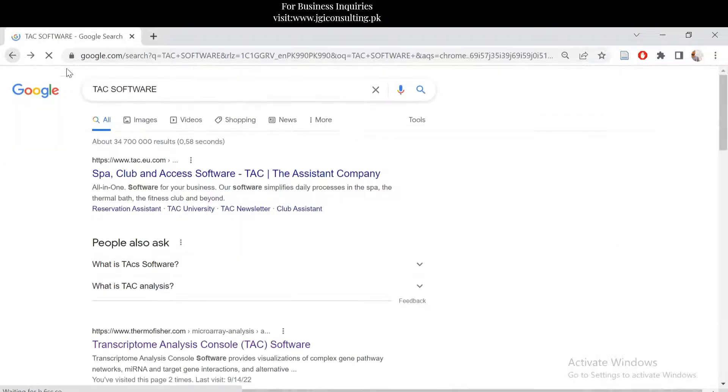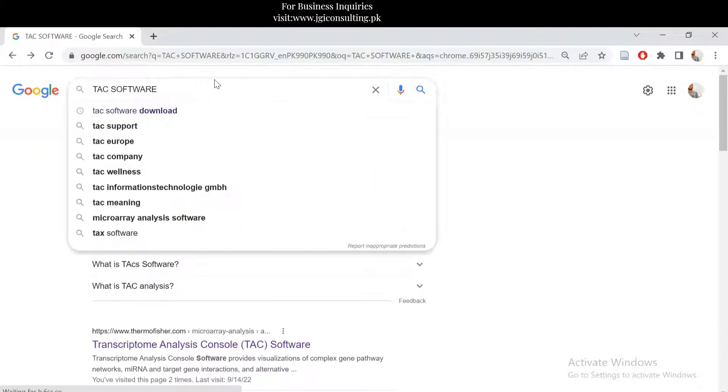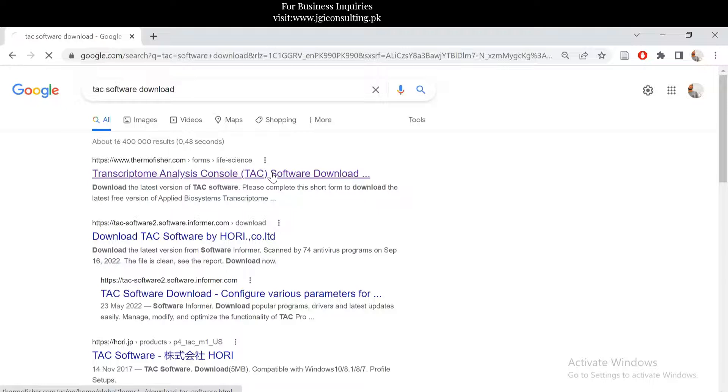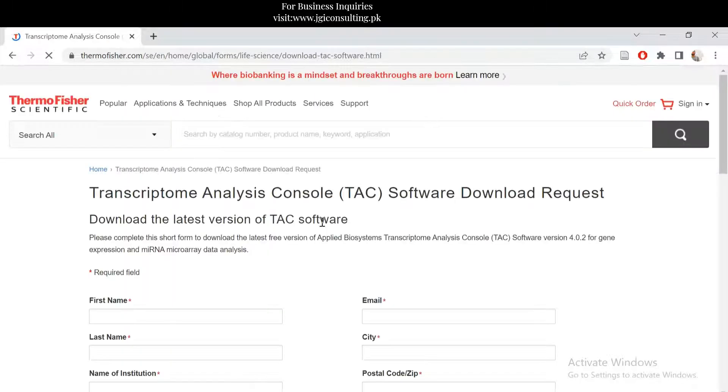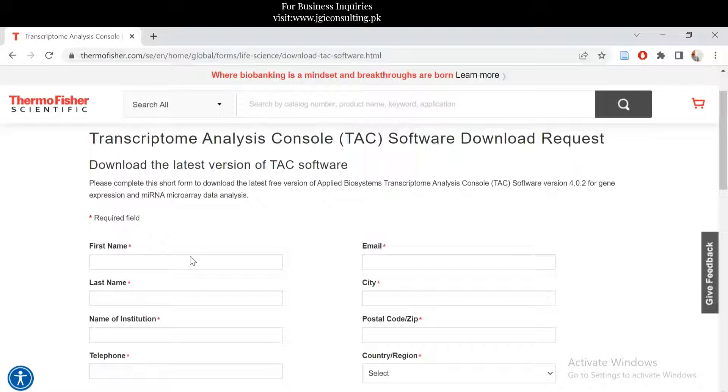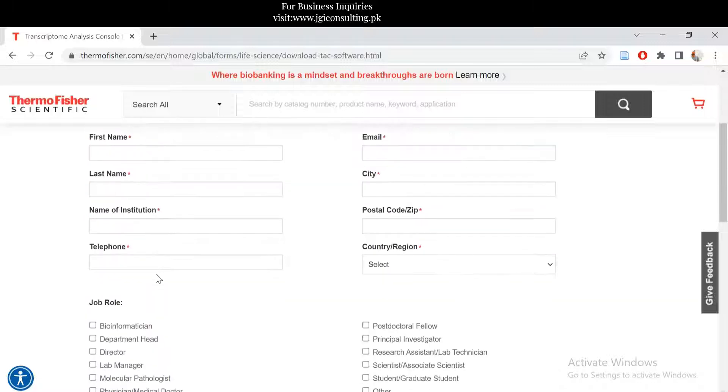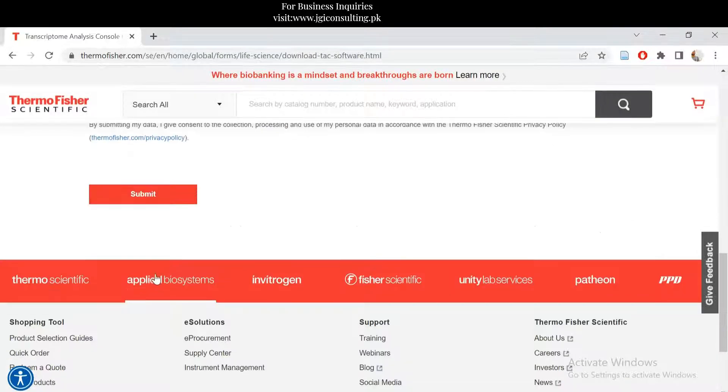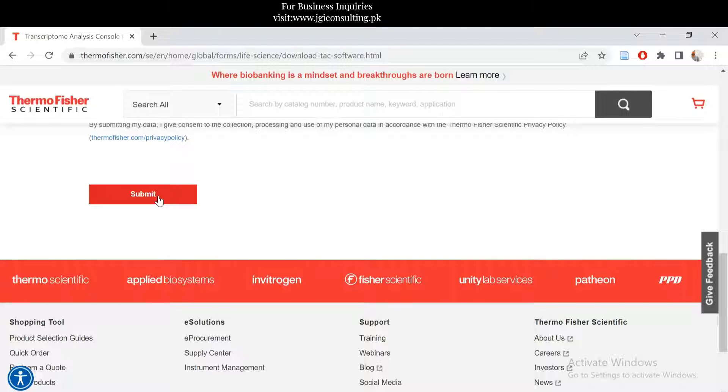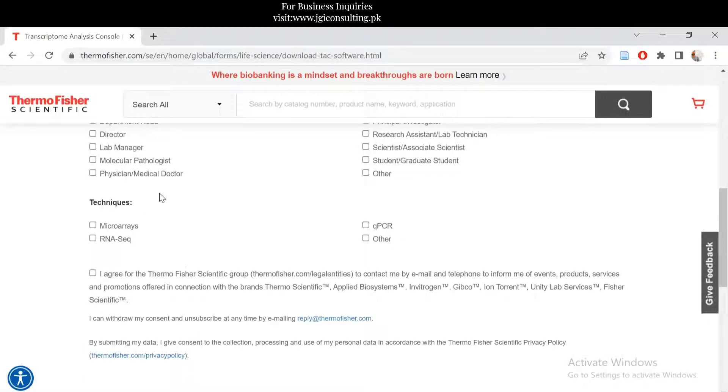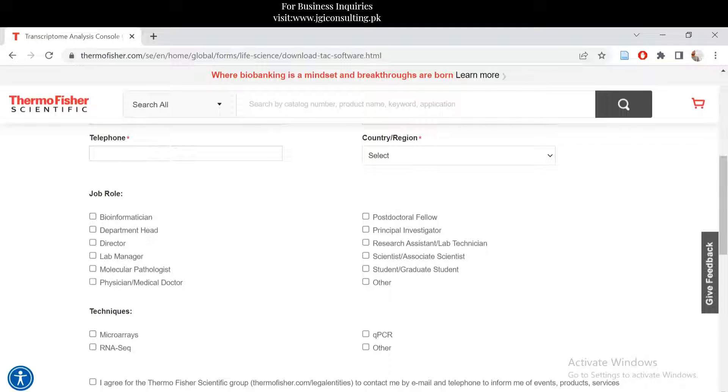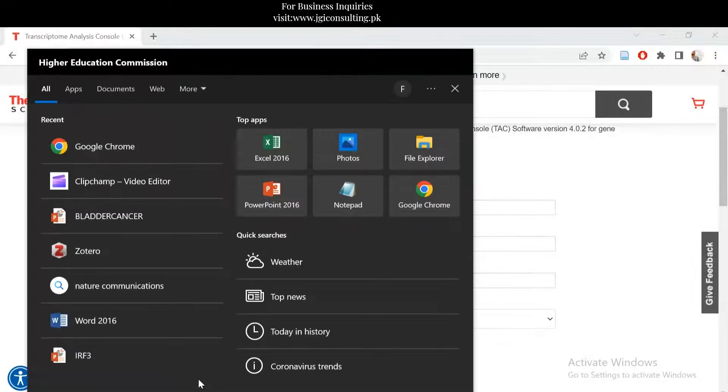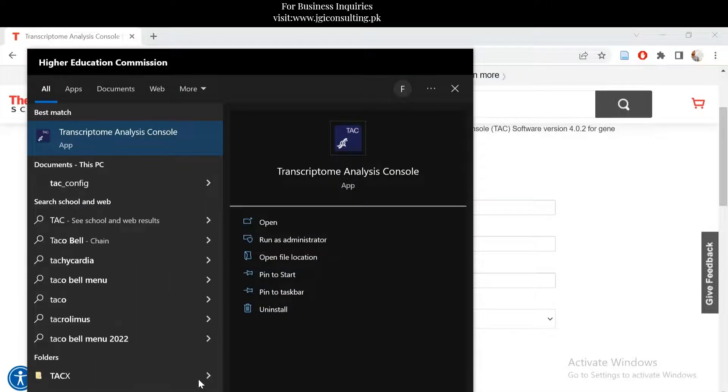You can download it from if you just write download, and you can download the software from this website. You just need to fill in the form and then submit. After submitting it, you will get a link on your email where you can download the software and then you can use that software.